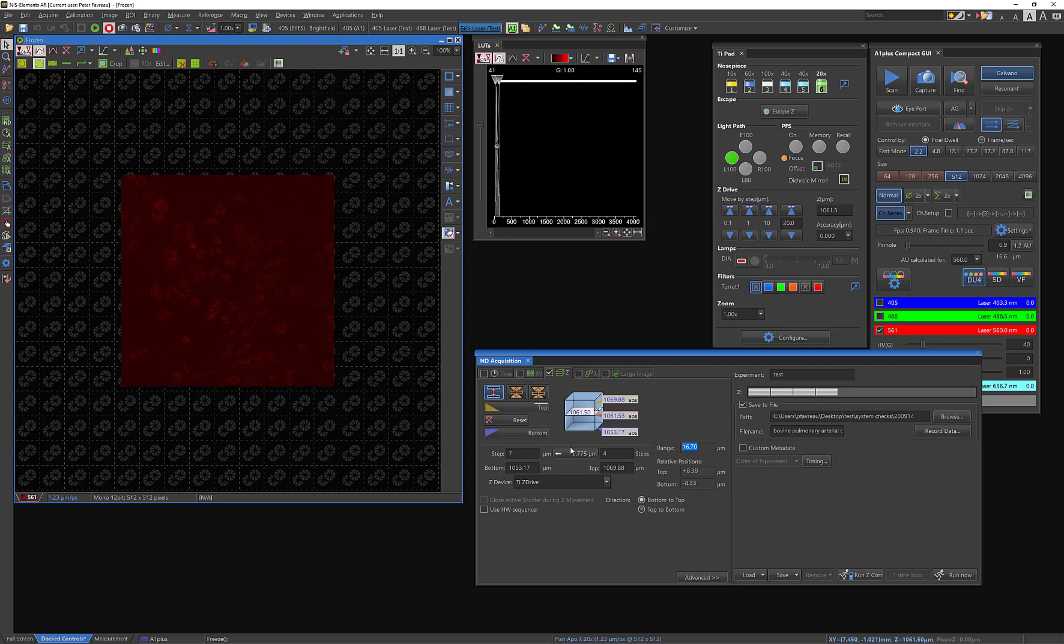And you can tell it to go a certain step size. So if I wanted to go 10 microns per step, you can do that, and it automatically rounds everything. So it'll take three steps, essentially, where the first step, it'll take an image, it's probably down here, and it'll take another step 10 microns from there, and it'll do some third step that's going to be about probably 6.7. So that's where those three steps are coming from.